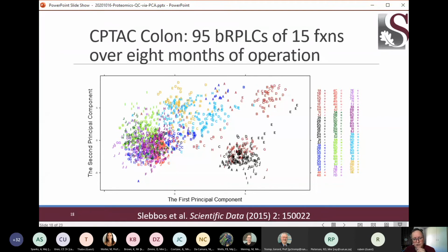So what we've done here is to use different colors and different letters to signify different periods within this. The very first experiments performed are shown in that deep red, and all appear at the upper right of this PCA diagram up here. The second set was run right on its heels, but maybe they'd done a cleaning or something, because the data all showed up down here.